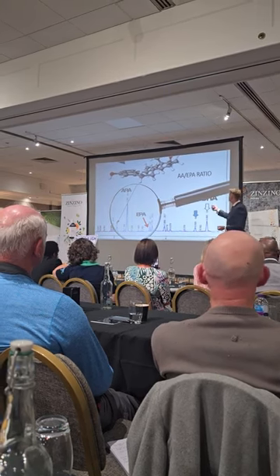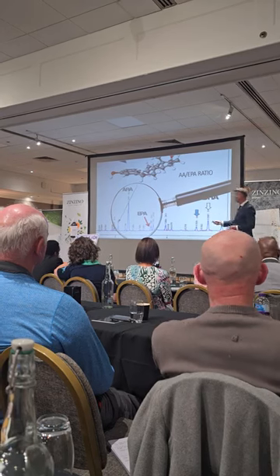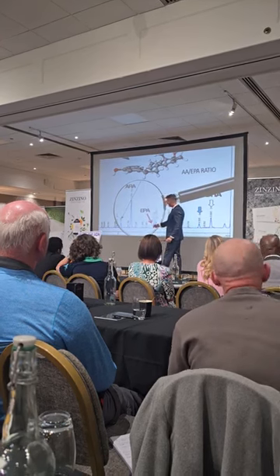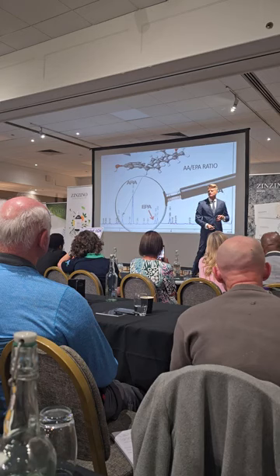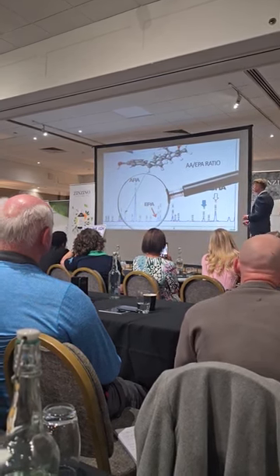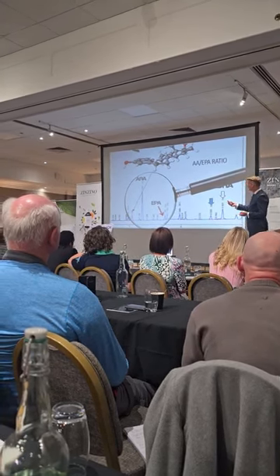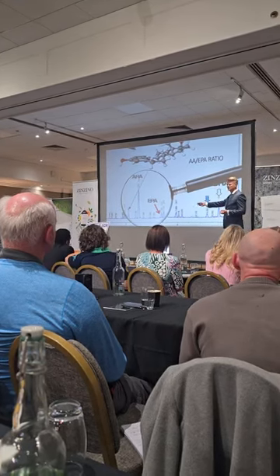A high peak means a high concentration, and a low peak means a low concentration. And when we look at the omega-6-3 ratio, we actually look at the difference in size between this peak, arachidonic acid, omega-6, and this peak, EPA. You can see that this peak is about 5 times the height of EPA. So in this case, the ratio is 5 to 1. It's really that simple, and this is what we call a relative analysis. It's like a percentage. So the omega-6 peak is about 500% of the EPA peak, relative, right?